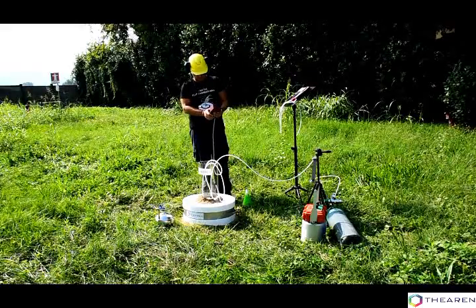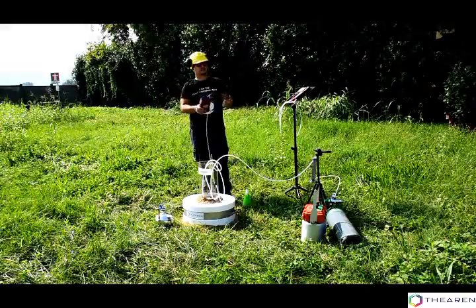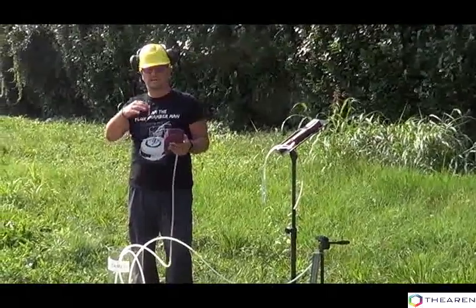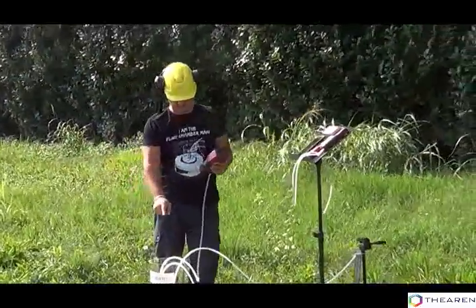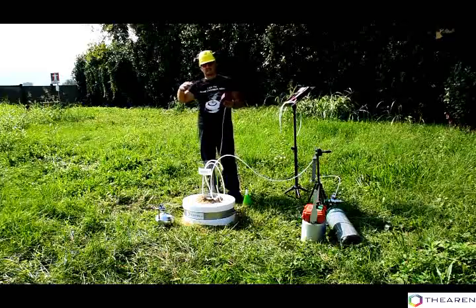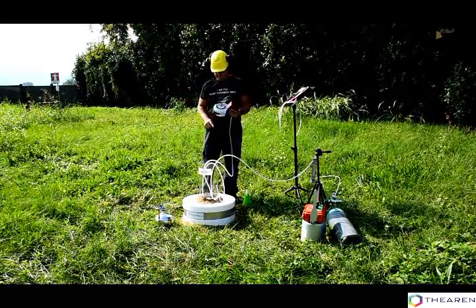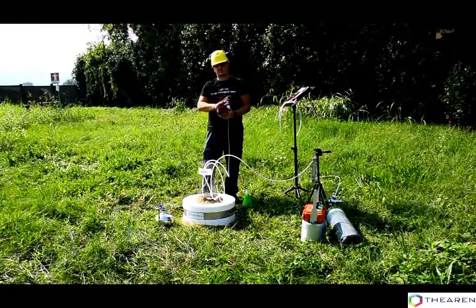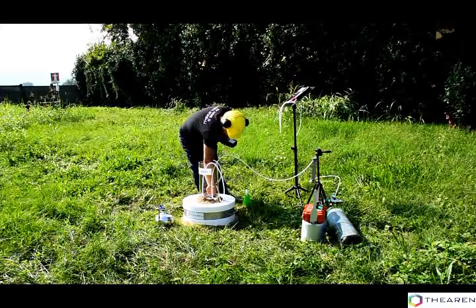Both during purging and during sampling, physical and chemical parameters must be measured to ensure proper monitoring management. The initial purge must be of a volume equal to about 4–5 times the internal volume. For the Thearen chamber, which has a volume of about 40 liters, the carrier gas is normally pumped at 4 liters per minute, so purge time is 45–50 minutes.